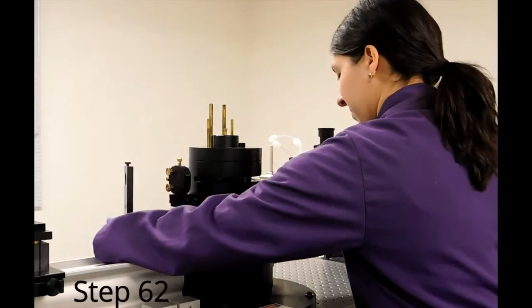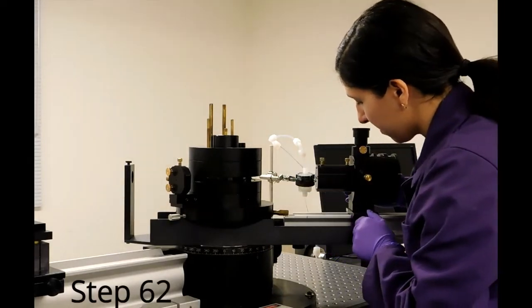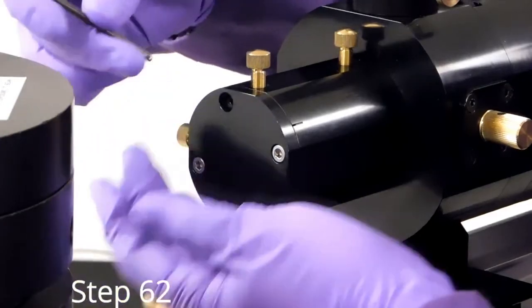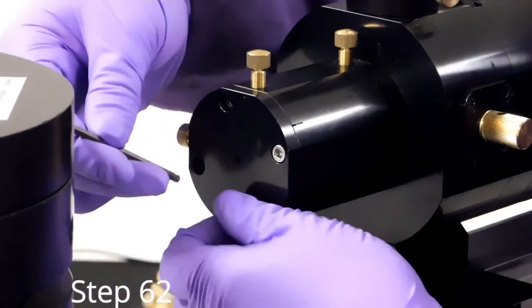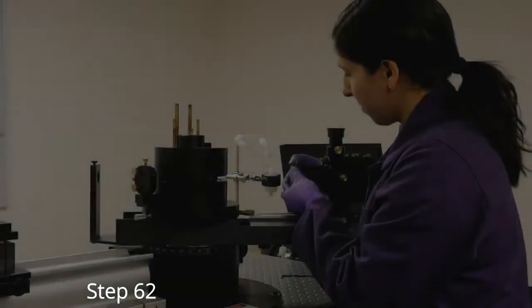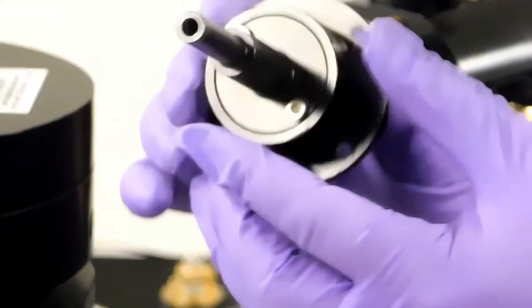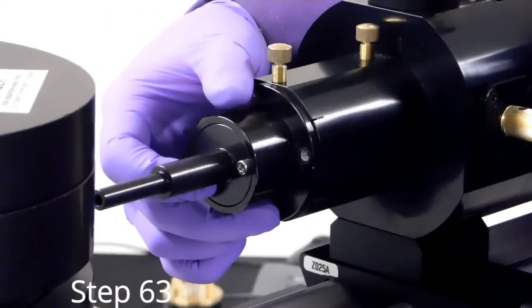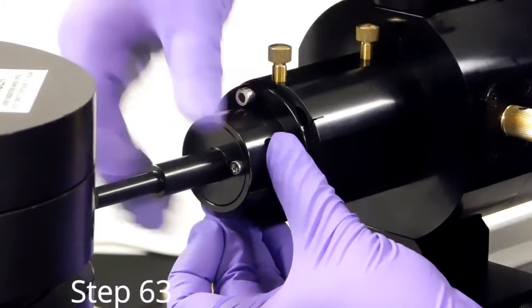Loosen the locking foot on the NDO and move the NDO back on the detector rail. Using your M4 hex key, remove the face plate on the NDO. Locate the snout. Using the same four screws that just held on the NDO faceplate, attach the snout.